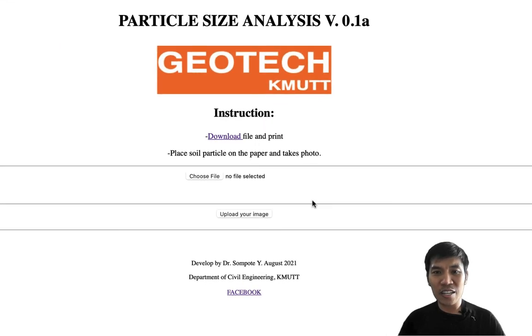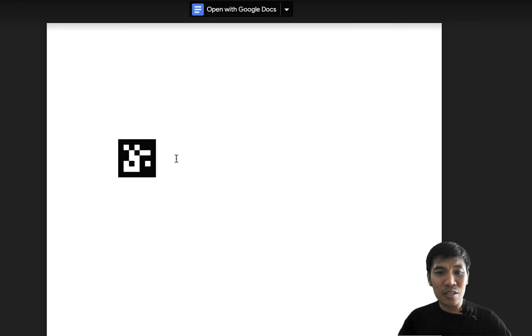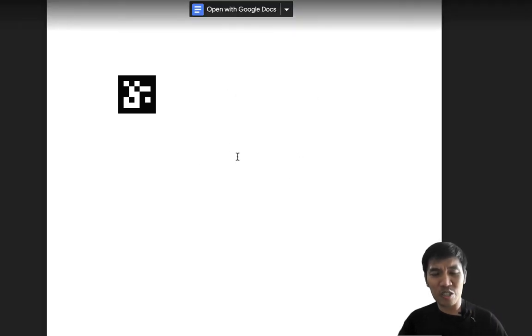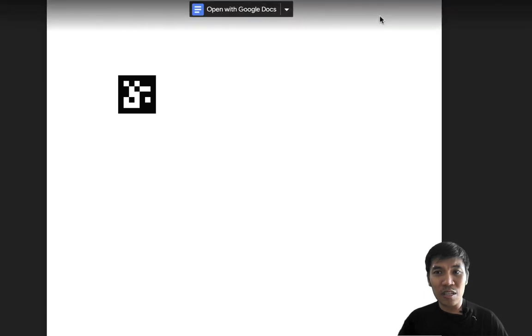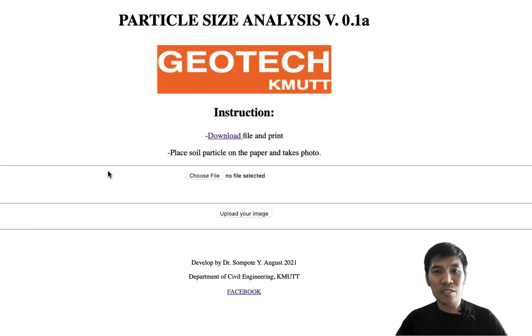The user interface is not very fancy but it's quite easy to use. You download this file first. This is a plain paper with one target marker. You download this file, print it out, put the soil on this paper, and take a picture.